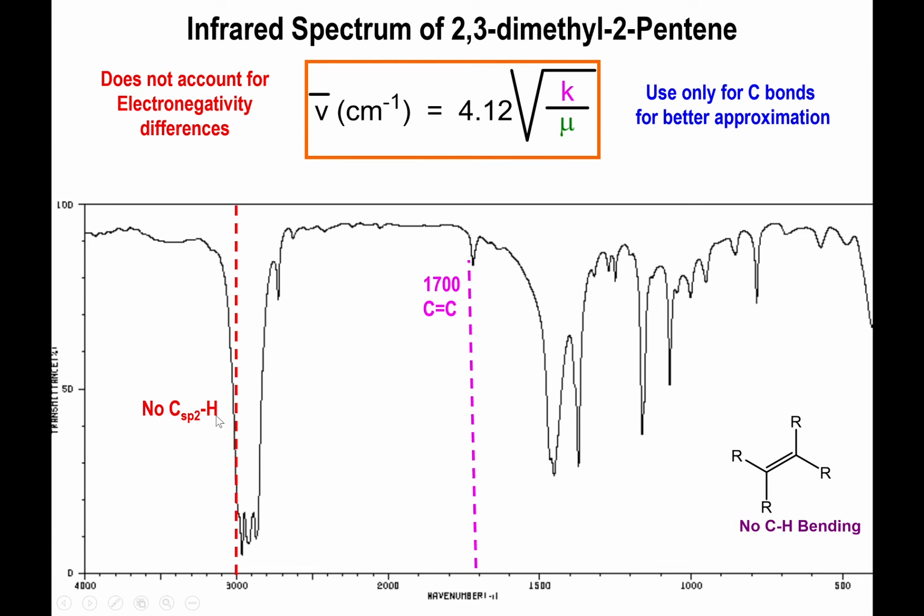And here it's even worse because as a result of not having the carbon-hydrogen bond on the alkene fragment, you don't see that peak above 3000, right? It's basically absent here. And this makes the assessment a little bit more difficult. So you have to be a little bit careful and you have to be on the lookout for this type of issues that may arise with the spectrum.